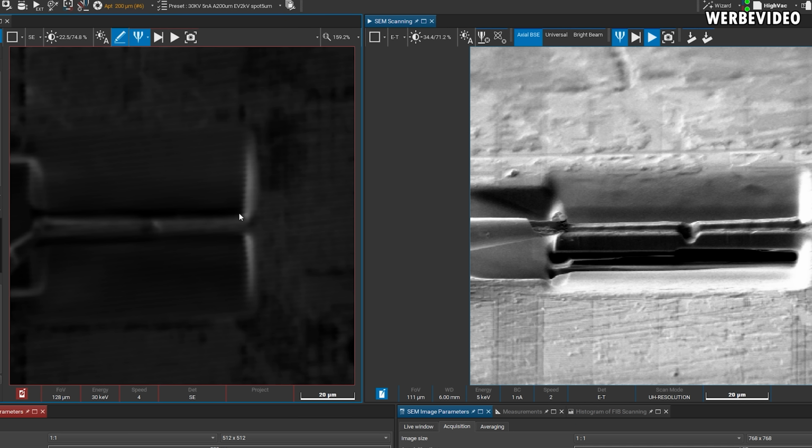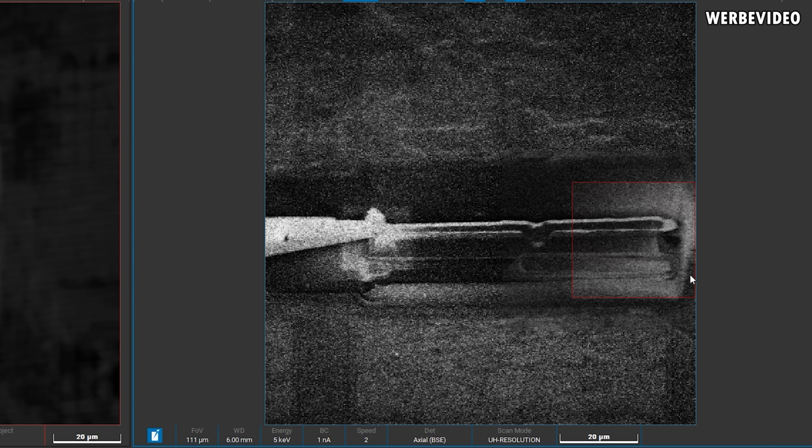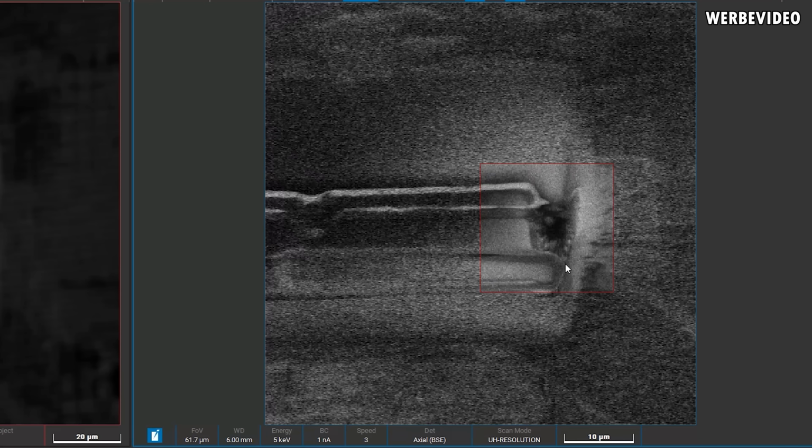This way the lamella is connected with the needle and we can now cut off the lamella at the back part. In the video it kind of looks like everything is melting, which is kind of funny. It looks like the silicon is melting, but this is just because, again, this is a very fast time-lapse and it would take a very long time to see this in real time.